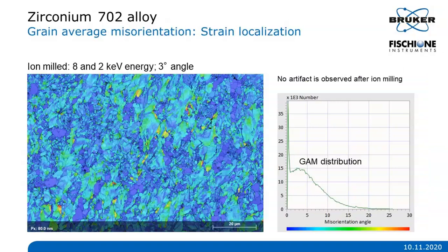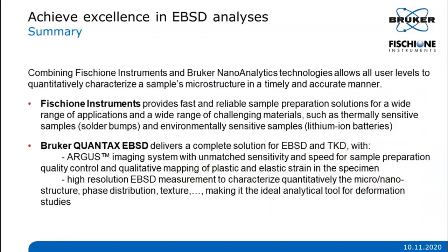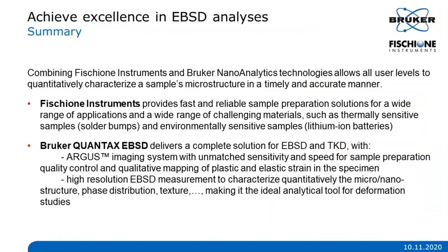Pavel, maybe you want to start by. Yes, go on. I have a nice question I would like to answer related to the presentation. The question is, how long have the austenite samples been ion milled, and what angle would you recommend for lead-free solders? To answer the first question, all the results that you can see here and all the materials, you can get exactly the same result of sample preparation and EBSD measurement if you mill less than 1 hour.